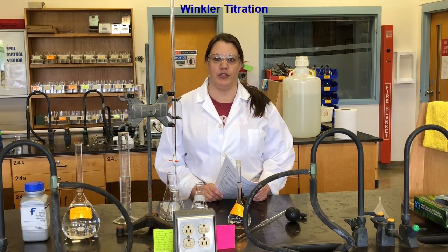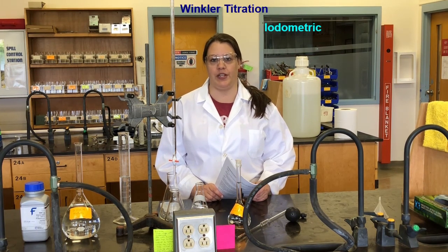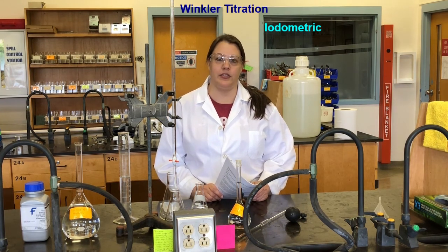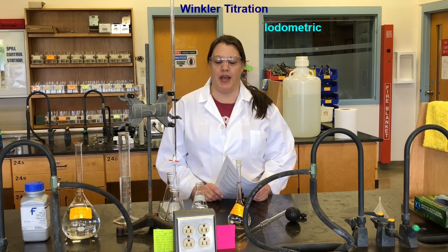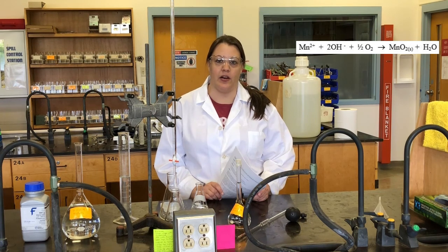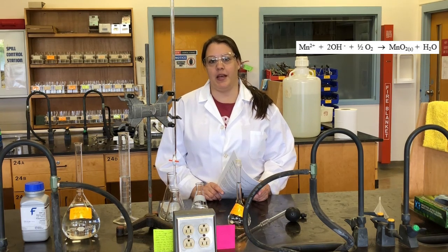So today we're going to be doing a Winkler titration, which is an iodometric titration, meaning it uses iodine. And in this method, the oxygen in the sample is capable of oxidizing manganese. So it oxidizes manganese, and then in that higher oxidation state, the manganese can oxidize iodide to iodine.